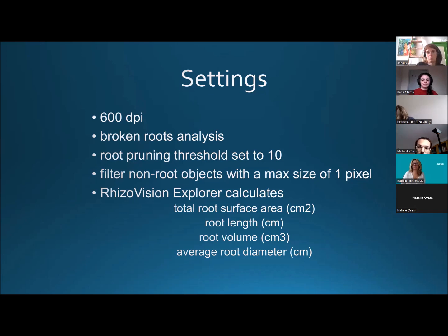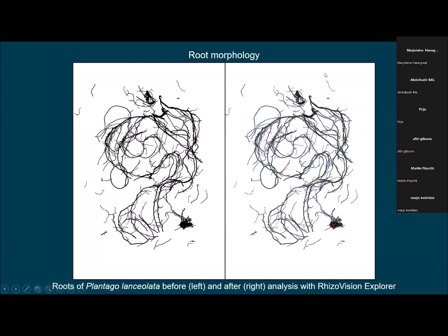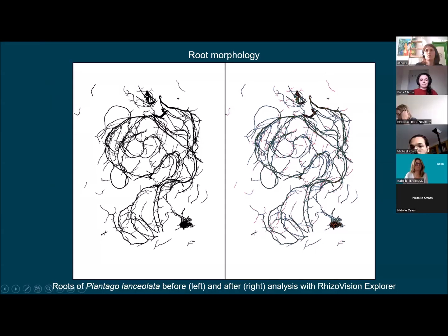And there's also an option to set additional settings so that it calculates this data regarding different thresholds, for example, diameters between 1 and 2 millimeters, 3 and 5, and whatever one likes to know. And here I did this with different settings, and each color is for a different diameter section.